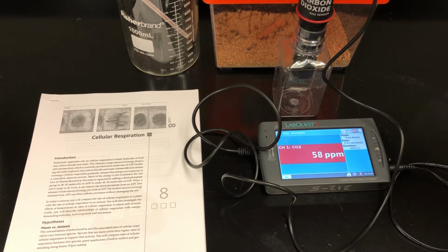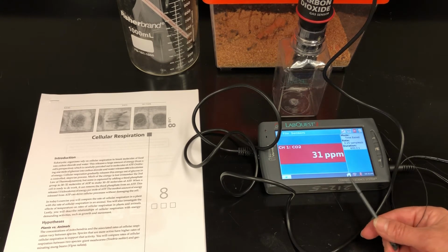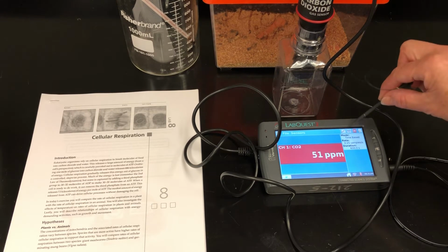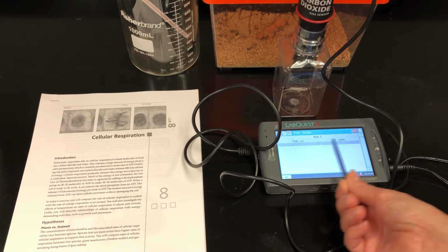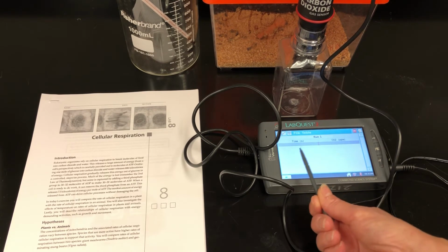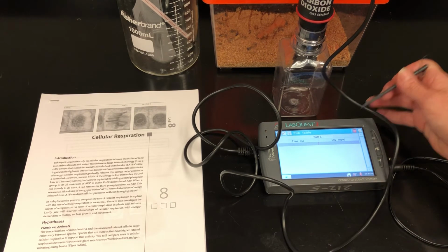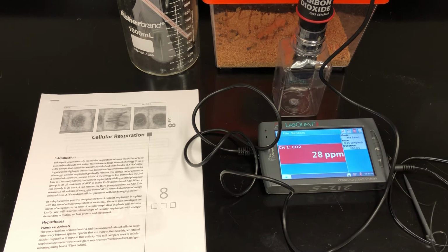You want to set up those parameters so that your LabQuest unit is going to automatically take a measurement, for example, every 5 minutes. And then that will come up in a graphing of the data, so you'll have your time, like the CO2 at time 0, the CO2 at time 5, CO2 at time 10. And from that, we will create our data tables for this lab. So this is the kind of equipment we're going to be using.